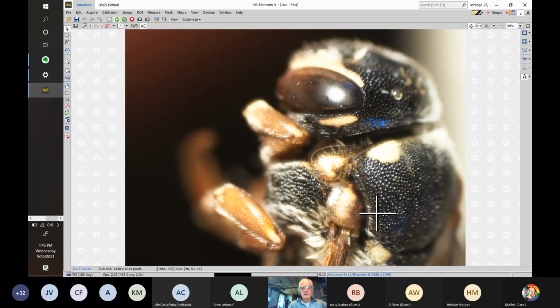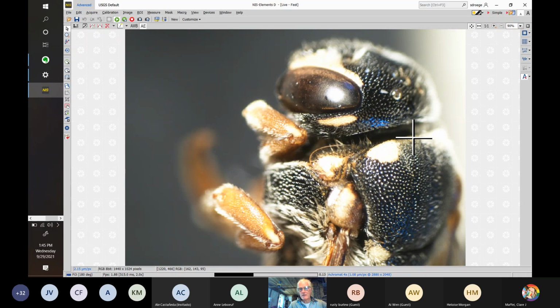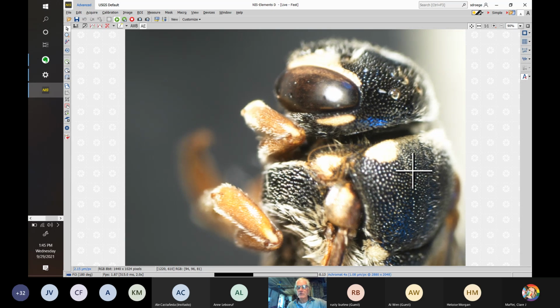Yeah, one of the issues here is you can't even see, so here is the scutum, and here's a pronotal collar with the angle on it. So normally you would see a segment, at least a ribbon of this segment going all the way across and joining on the other side. But you do not, because the scutum is built up or raised above that so much that it's hidden behind it. So all you're seeing here is the edge of the scutum and not the pronotal collar at all. So if you have specimens of any other bee, you would see something.